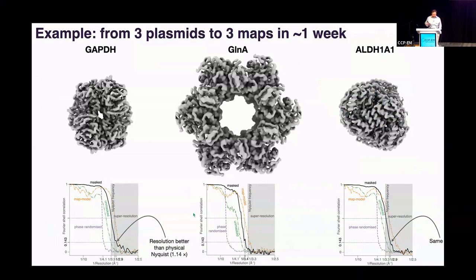Right, so what else was important in this? I'm going to put in a few more details here because of the particular audience, and one of them is magnification. I think this is an important thing possibly to discuss either online or offline in the future, but each one of these structures was collected on a different day by a different person. We had lots of people involved in this, and they may have set up the optics slightly differently. There's no automated software to do anything on this microscope. It's all aligned manually by hand by users, mainly me, but other people as well. And so occasionally we would have different defocus settings or whatever. And so the magnification did change between different data sets. So it was quite important to get this right.